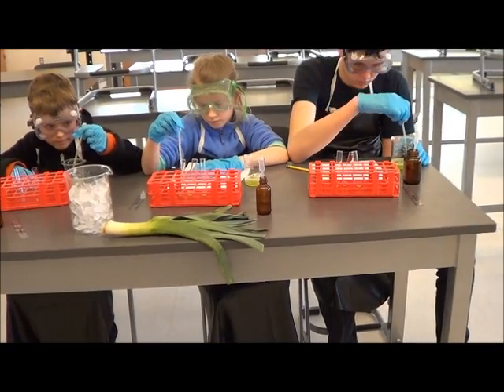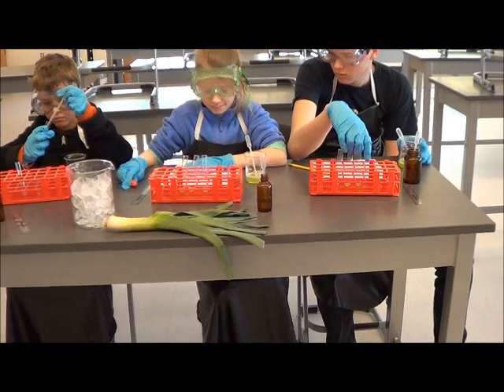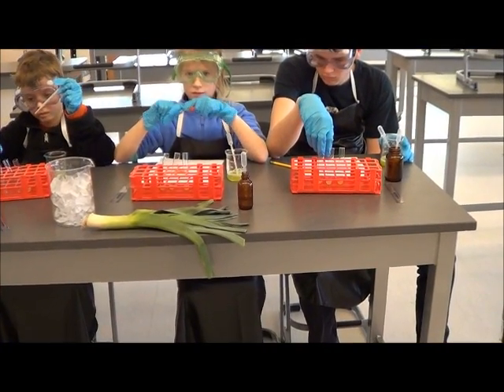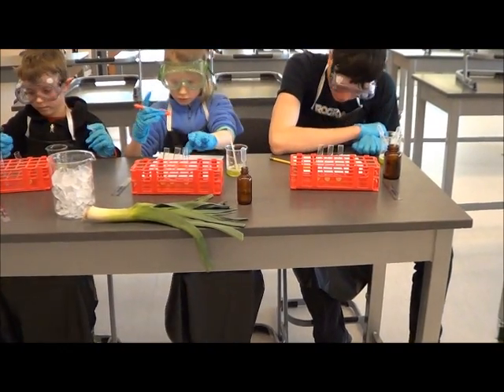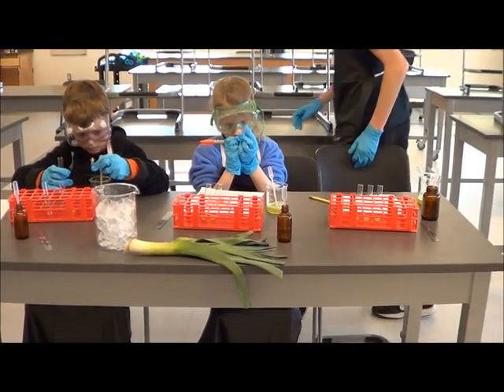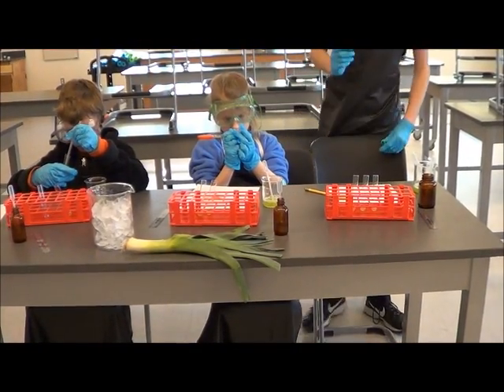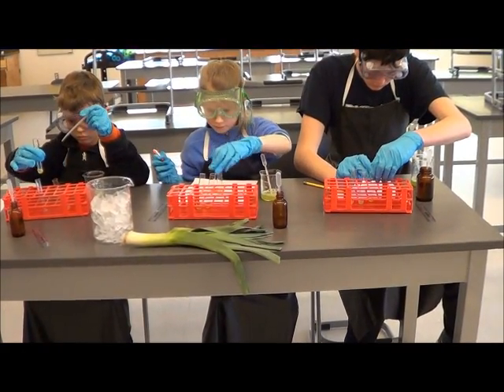And then you need to label them. So with the pen you're going to make an H for hot on one of them, a C for cold on another, and then you don't have to put anything on the other one. You should also probably put the letter of your name on it too, so that when we put them all together in the ice or in the heat, we'll know whose is whose.